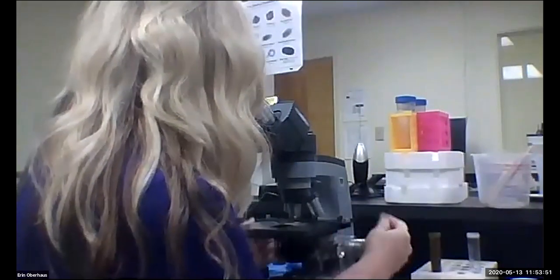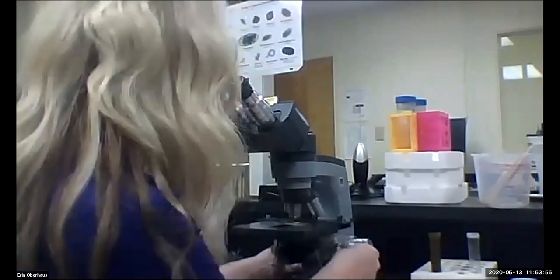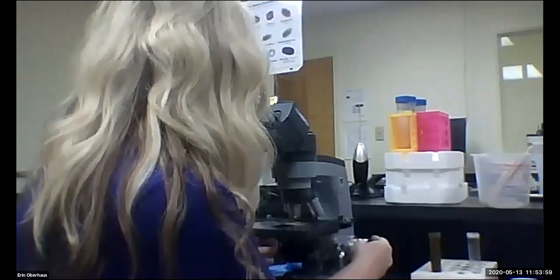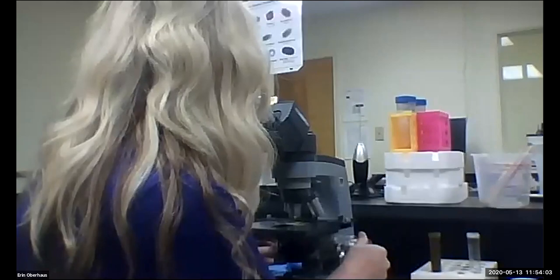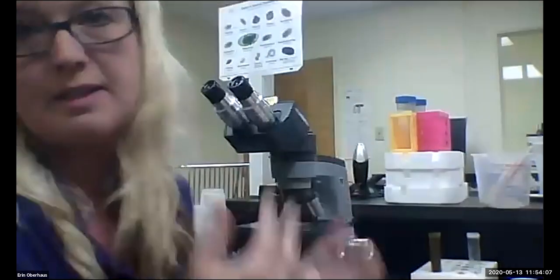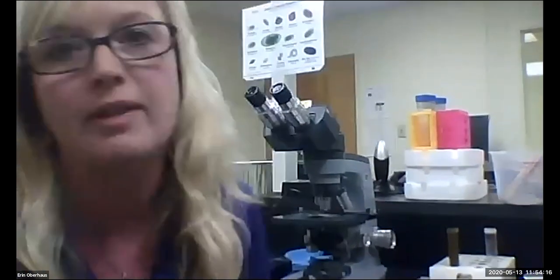I won't spend too much time because I know you can't see what I'm looking at, and there are some fungi. Now I would go through the entire surface of the cover slip, count every strongyle egg that I see, and then calculate my eggs per gram of feces, knowing that I used 2 grams of feces.